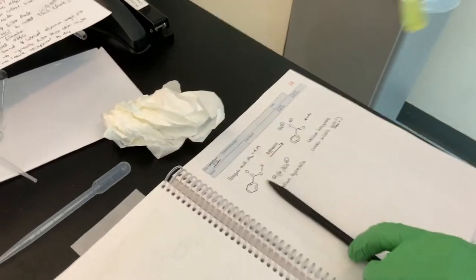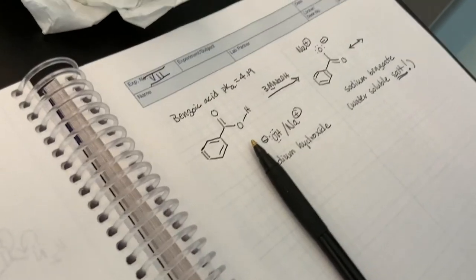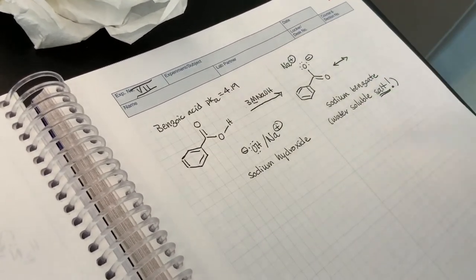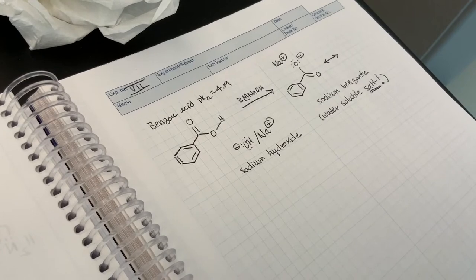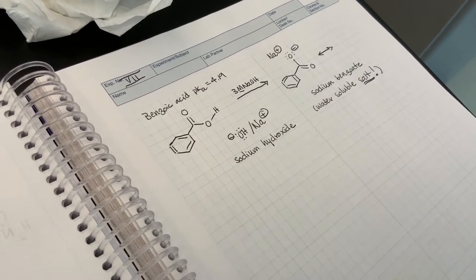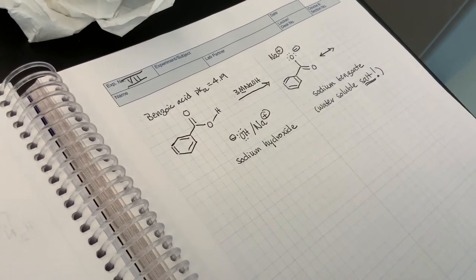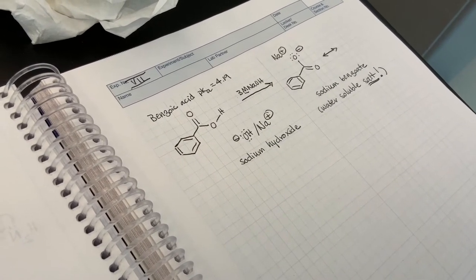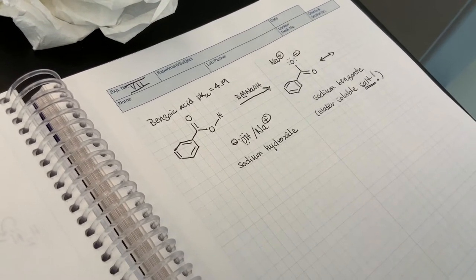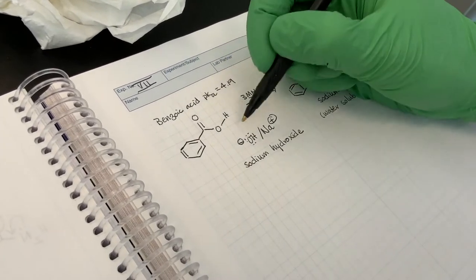So of course, we've got benzoic acid. This is a carboxylic acid. The carboxyl group is bonded to a benzene ring, and its pKa is in the typical range of carboxylic acids, so 4.19. A little bit more acidic than acetic acid due to the electron withdrawing benzene ring. And what we just added was a 3-molar solution of sodium hydroxide. So sodium hydroxide, we know, is a strong base. Benzoic acid is a weak acid.